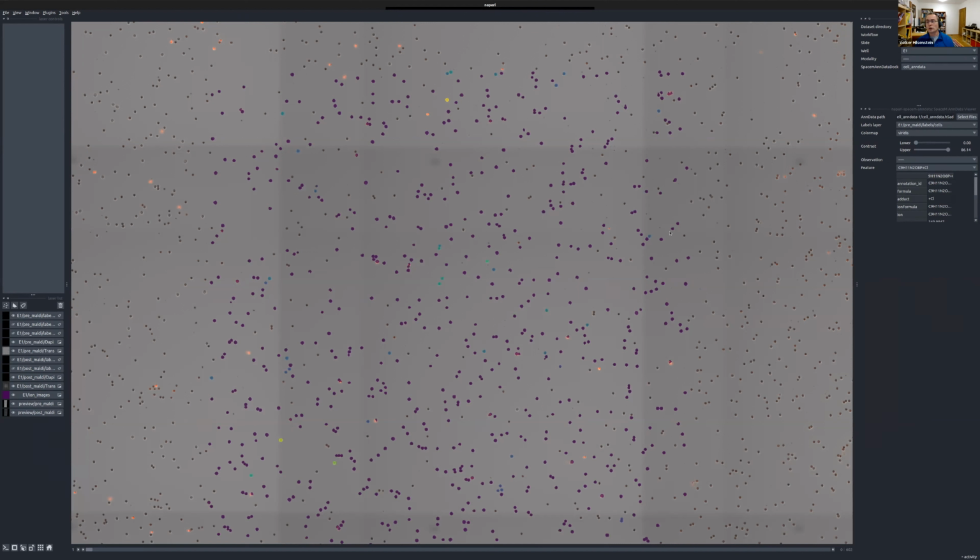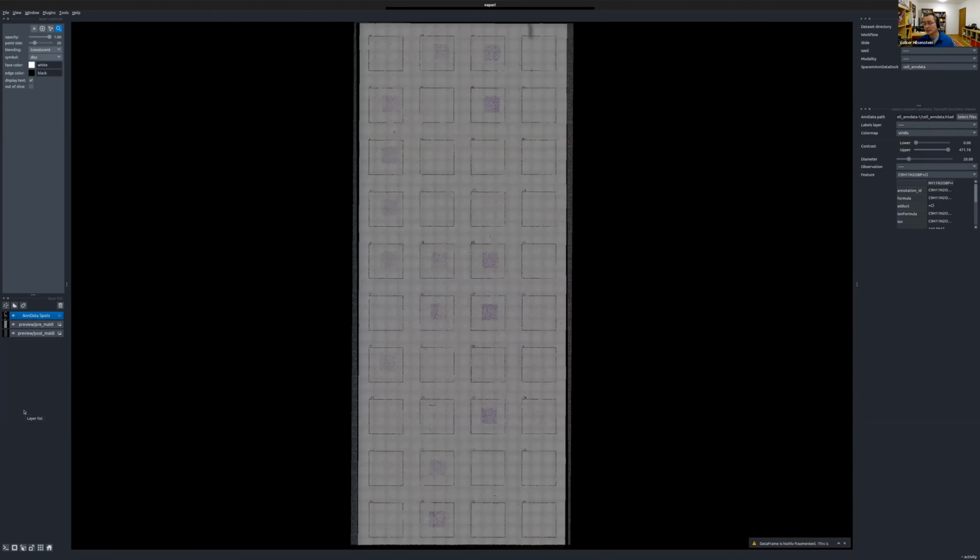So now we're looking at one well, but we have a dataset selector. So the dataset selector helps us dealing with whole slides. We might have 40 wells and the layers become too many in napari to handle. So this is a way to basically select one thing, but here it's not with flat fielding, unfortunately.